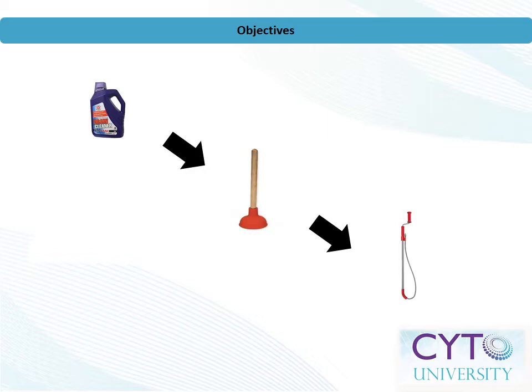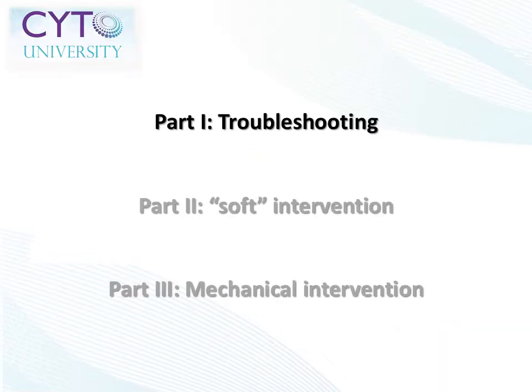May we never forget Shapiro's first law of cytometry: a 51-micron particle clogs a 50-micron orifice. Part 1: Basic Troubleshooting.